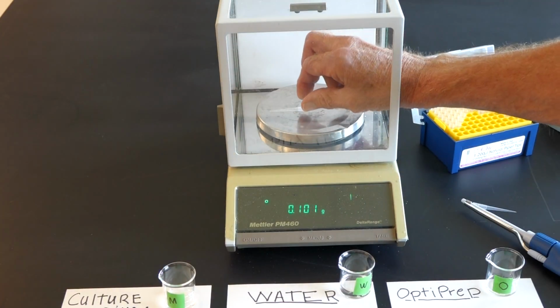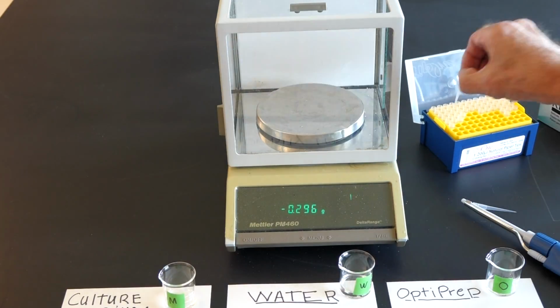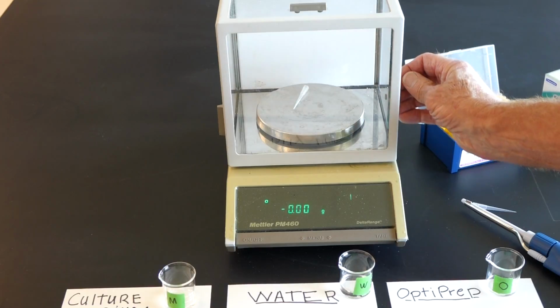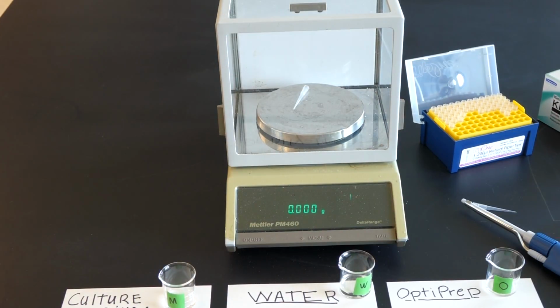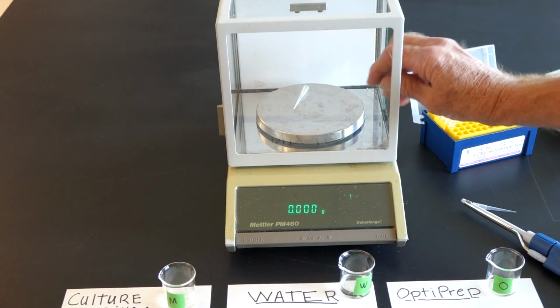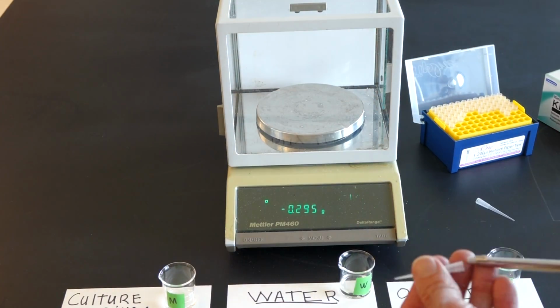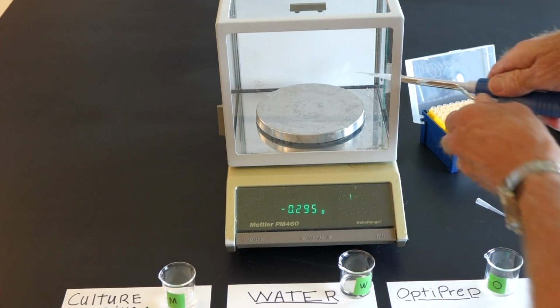If I take another medium here, in this case, this is a density gradient medium called OptiPrep. Again, I'm going to tare the micropipette tip to zero. Tare it to zero. Pick up the tip that I tared. Place it on the micropipette. Pick up exactly 100 microliters of the medium. Eject it onto the pan again.